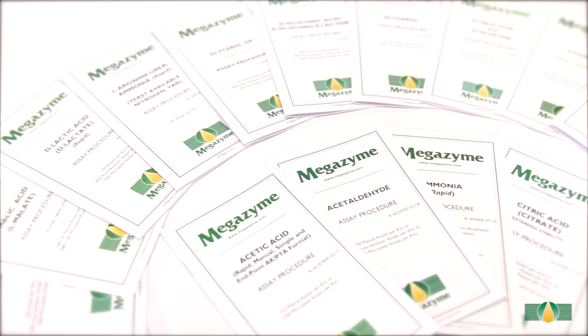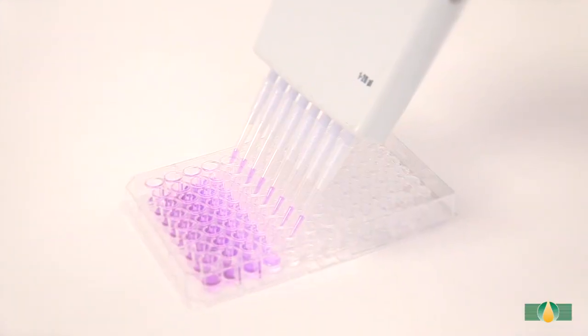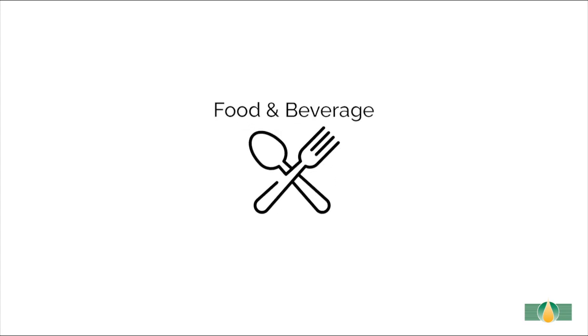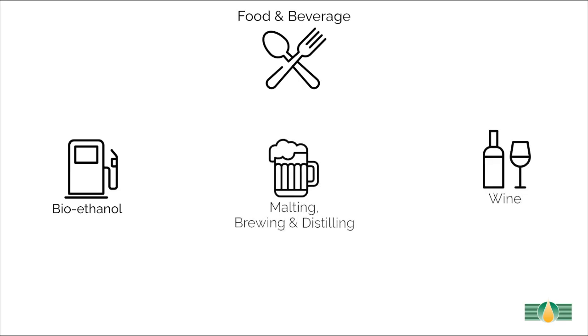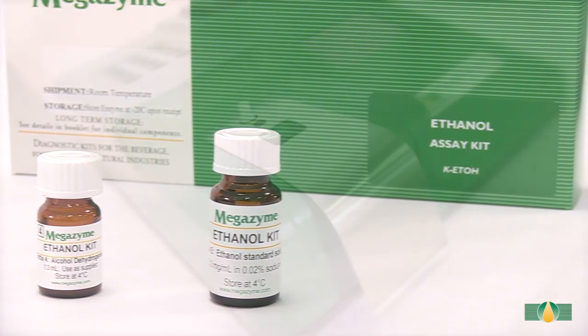MegaZyme provides an extensive range of assay kits for use in various assay formats including auto analyzer, microplate, and manual spectrophotometer. This ethanol assay kit can be used to accurately measure ethanol in various sample types throughout industries such as food and beverages. This video tutorial will demonstrate the use of the kit with a wine sample using the manual spectrophotometer format.